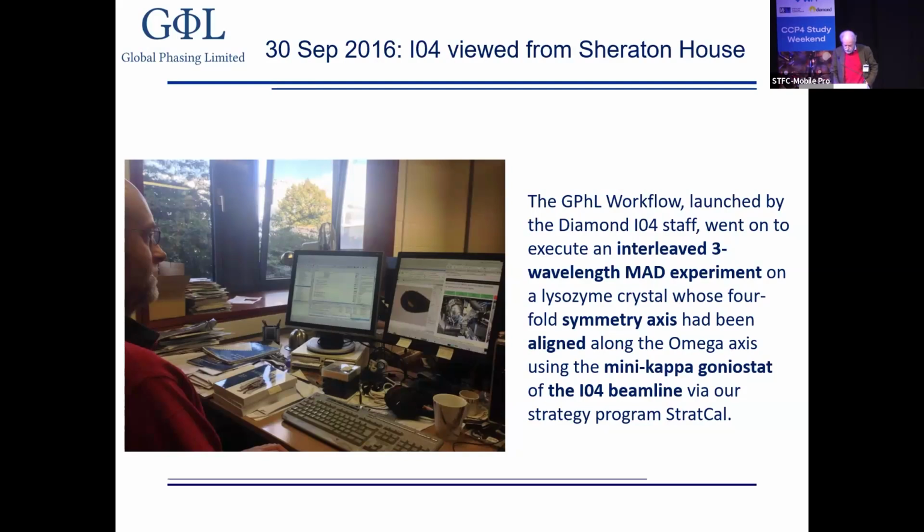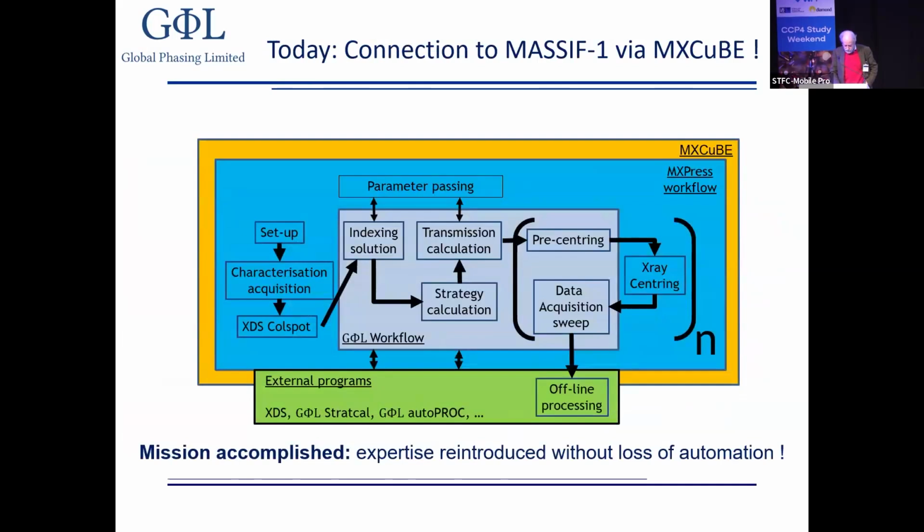Then circumstances led to that collaboration having to end, but the way we had coded our workflow was such that it was possible to switch to MXCuBE as the beamline control system with which it was talking. And there's been a lot of work here. I'm mentioning as an endpoint today the fact that it is now completely integrated within the operations of the unattended data collection beamline that was a pioneer in the field, the MASSIF-1 beamline. So in a sense, that part of the development we can consider as completed, mission accomplished. We wanted to reintroduce expertise without loss of automation, where there is no loss of automation if you can be driven from outside by an unattended data collection procedure. But so this is in production now.